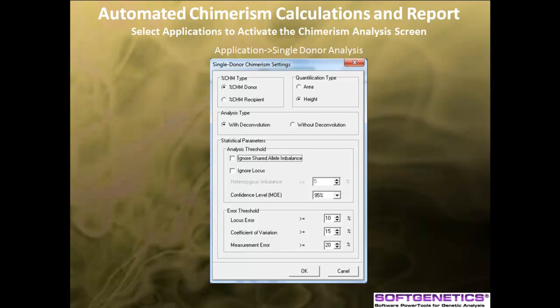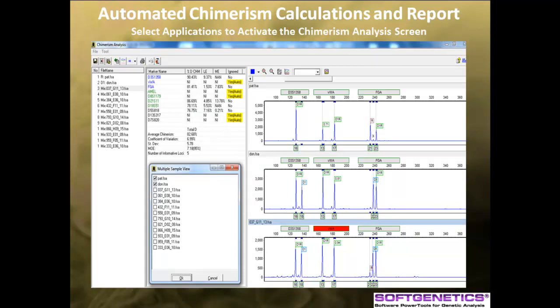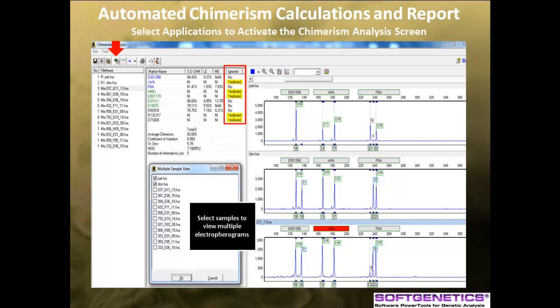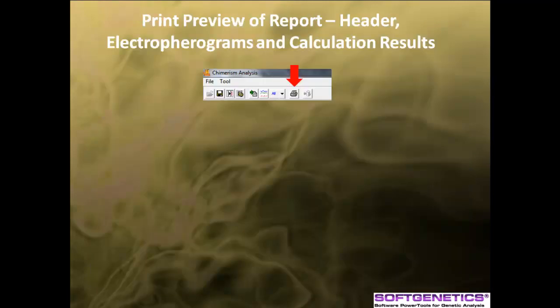Quality statistic specifications are selected. The automated chimerism calculations are displayed in the center table. Any markers that have a Yes in the Ignore column are ignored by the software based on the settings. You can also right-click on a marker and manually ignore it from your calculations. To view the result for a given file, click on the file name in the list at the left. To view multiple electropherograms, activate the multiple sample view function and select the desired electropherograms. Any markers highlighted in red are not informative or ignored. You can print the summary report by clicking on the print icon on the toolbar.